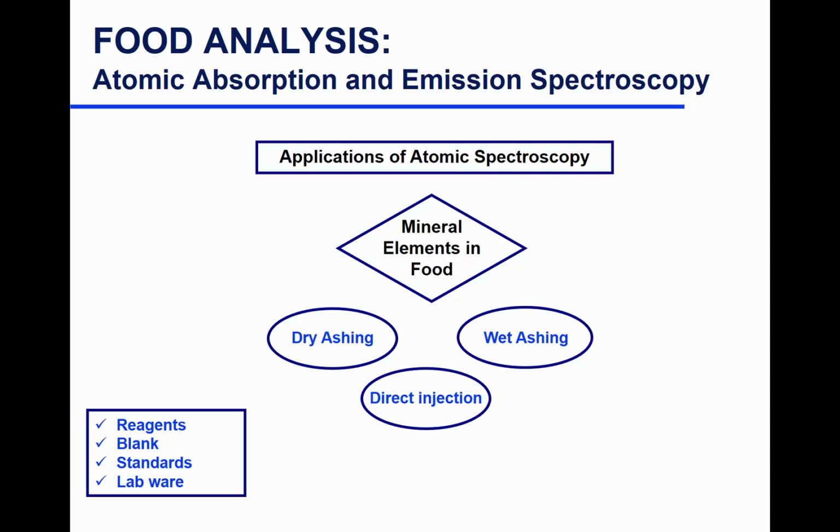All right, so I have here reagents, blank, standards, and labware. Why are these important? It's very important to have a blank. Those of you that did the lab, why is a blank important?